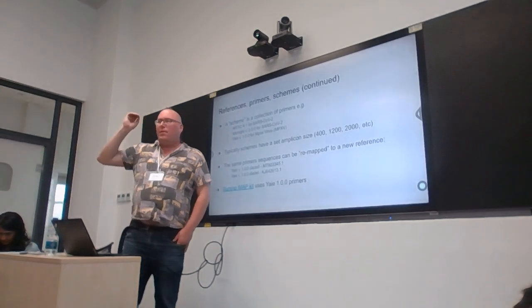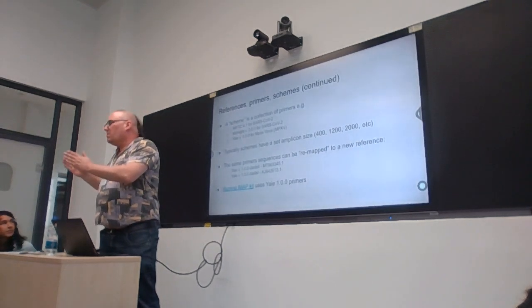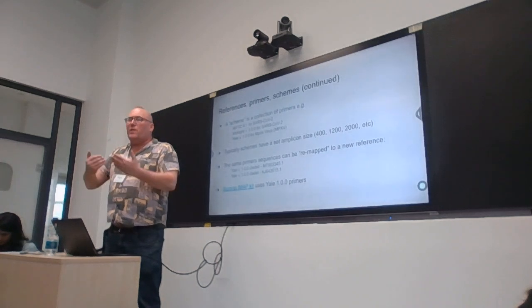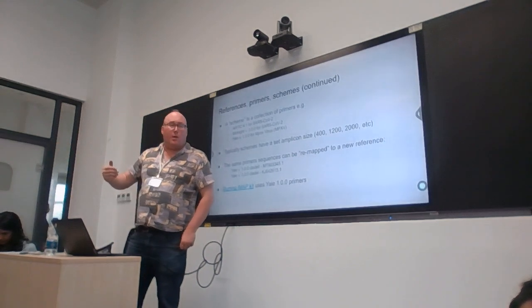We had to do those updates because the virus mutates and the primers no longer match the virus, which means they don't amplify properly, right? We get what's called primer dropout, okay?